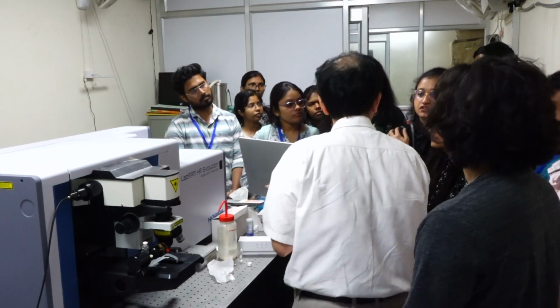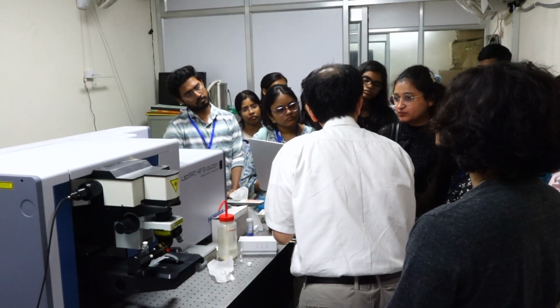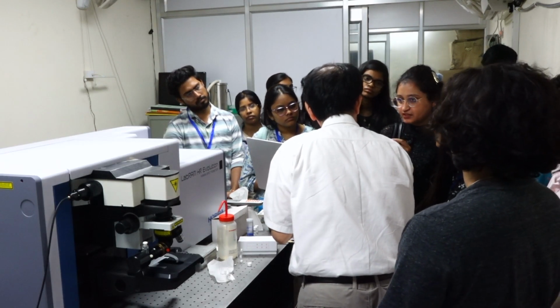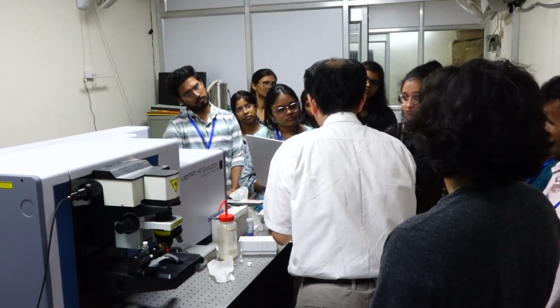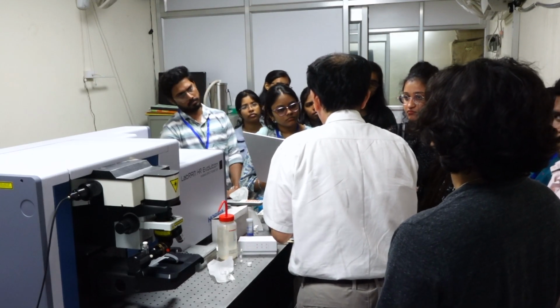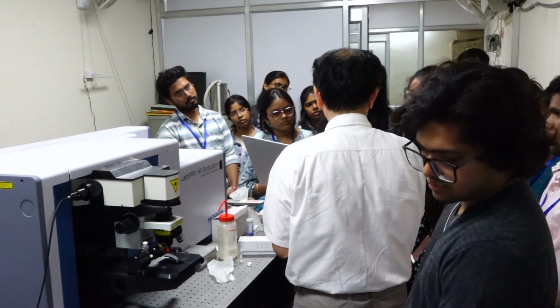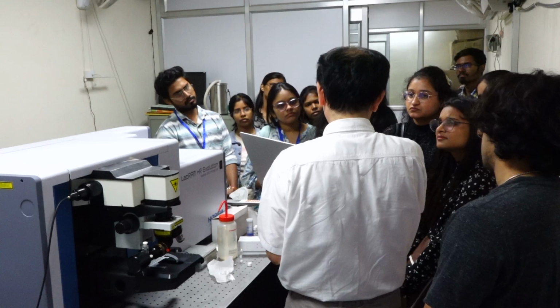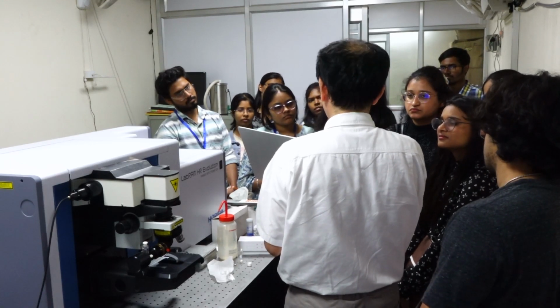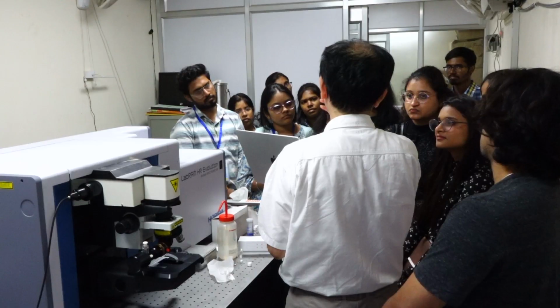So, in order to decrease the noise, we need to increase the acquisition time and decrease the accumulation number. Partly, yes. If the time is infinite, then we can increase both exposure time and accumulation number.